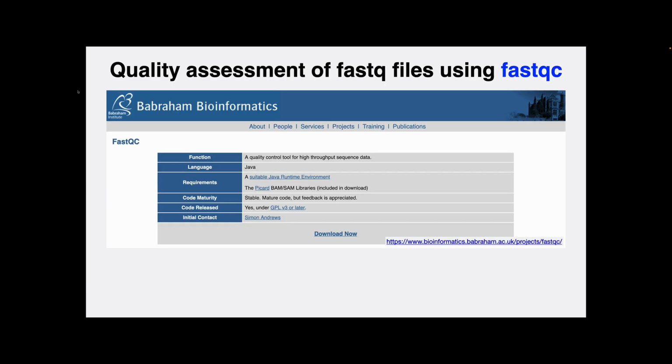In order to extract that quality information that's embedded in the FASTQ files, we're going to use a piece of software called FastQC. This is one of the command line tools that we installed in the last lecture, and we actually installed it in that RNA-seq Conda environment along with Callisto and MultiQC. If you want to read more about FastQC, I'd encourage you to check out their website, which I linked to here. But for our purposes, one of the great things about it is it's really easy to run. You just simply call the name of the program when you're at the command line and point it to a FASTQ file. Now, we installed FastQC in that Conda environment, so we have to first activate the Conda environment by saying conda activate RNA-seq, and then we can access FastQC.